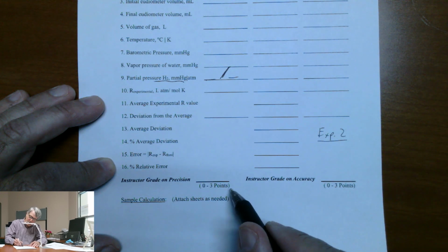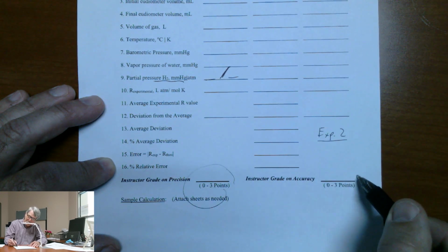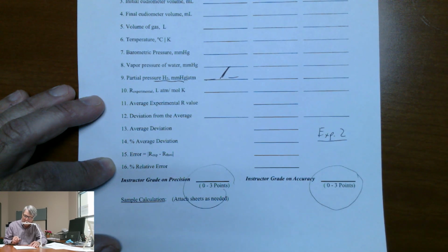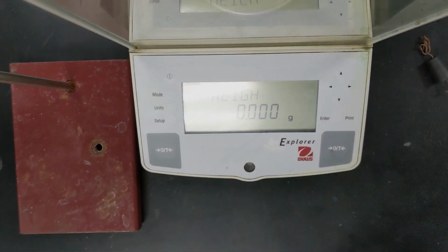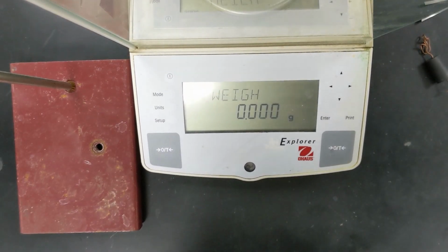And I noticed that there is a grade on precision and accuracy. So I hope for your sake that I do this precisely and accurately so that your instructor doesn't knock off points for experimental technique. Okay, and so that's it for this lab. We're going to go in the lab now and actually do the experiment. The first thing I'm going to do is weigh out my magnesium sample.